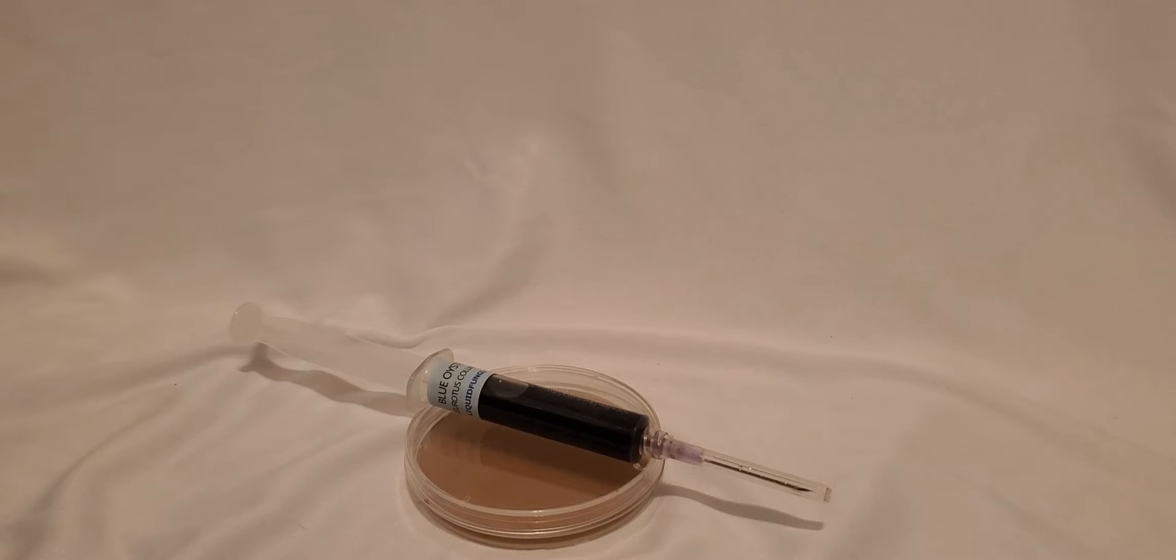Sometimes when you want to disperse a small amount of liquid culture or spore solution onto a petri dish in order to isolate it or maintain it, squeezing or pressing the plunger of the syringe can cause it to squirt everywhere or squirt more than you intended.